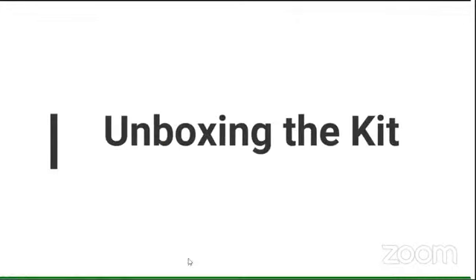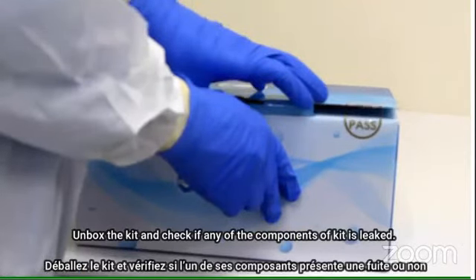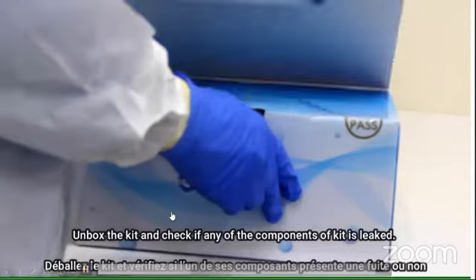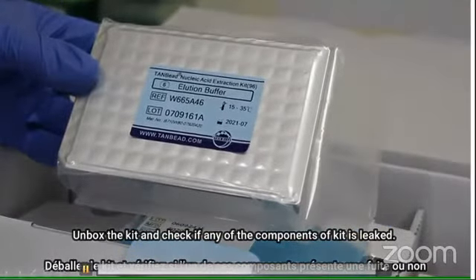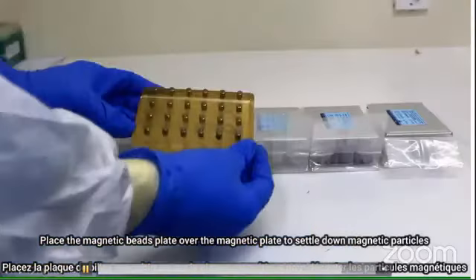So, unboxing the kit. For automation, RNA extraction, we are using the 96 well plate kit. First of all, unbox the kit and check for any spill and leakage in the deep well plates. The components of the kit include elution buffers, lysis buffer tube, plates, magnetic bead plate, washing buffer plate.